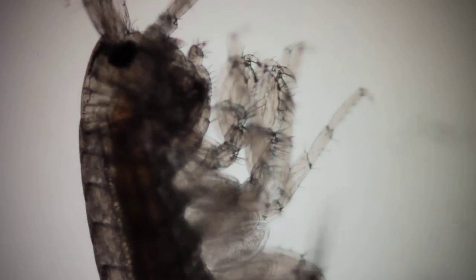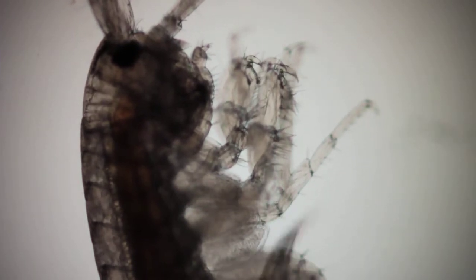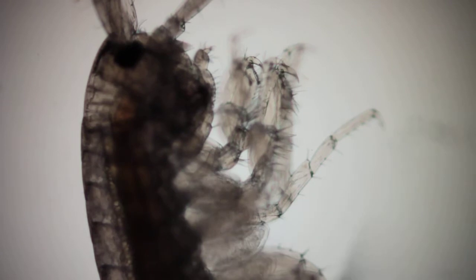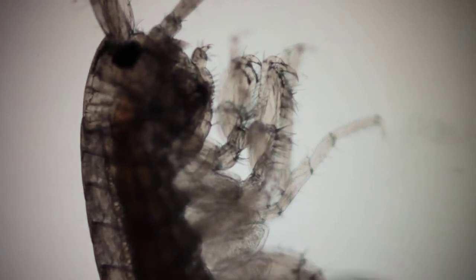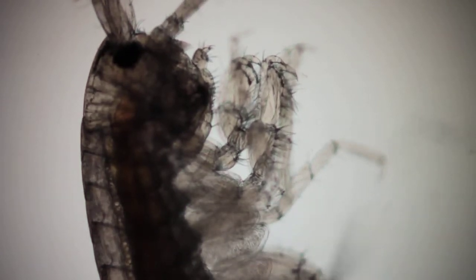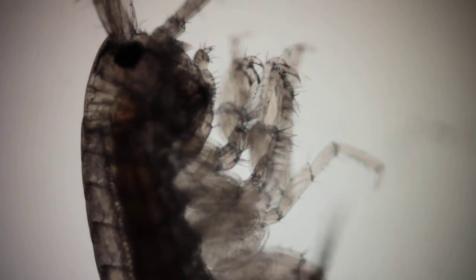I'm using a Nikon 4x plan achromat lens on a Nikon fluorophot scope.